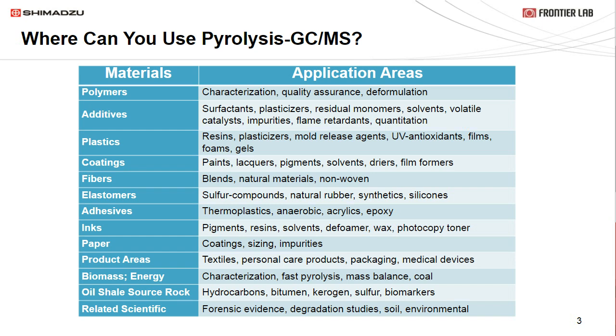Where can you use pyrolysis? Well, the short answer, there is no short answer. Pyrolysis in today's world incorporates much more than just the analysis of polymers. Due to the versatility of this technique, areas of interest such as contamination, comparison, quality control, and unknown analyses can be delved into. Pyrolysis is also extremely useful in material characterization.